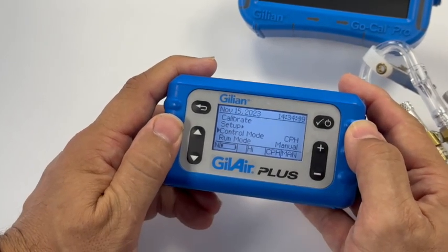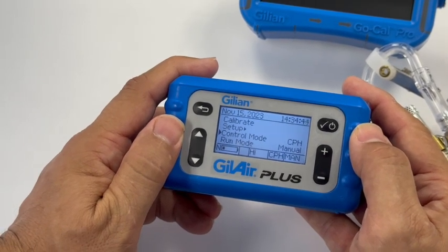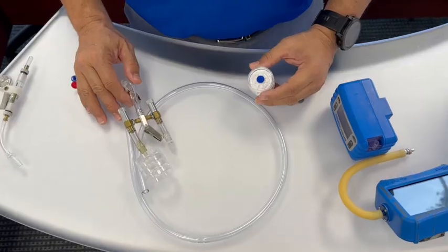Now you're ready to sample in constant pressure mode, which puts the pump at a default 18 inches of water of constant pressure. The pump will maintain this pressure throughout the sampling event. Now we will set up the sampling train, which will consist of the tubing connected to the manifold splitter.